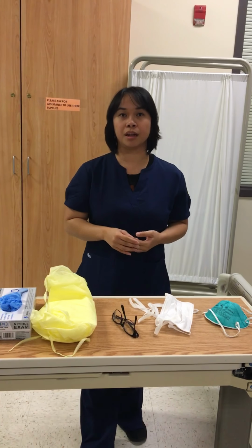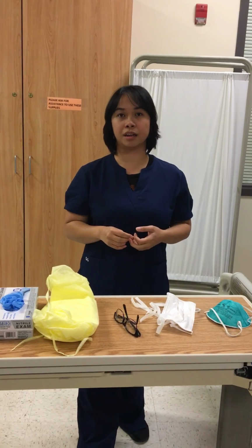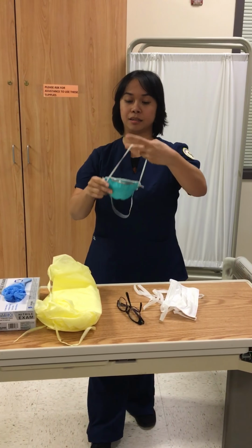So that means they are in a negative pressure room where there's an ante-room, like a room before the room, where you can put on your PPEs. So after I wash my hands for at least 15 seconds, I put on the shoe cover first, and then after that is the hair cap, and then after that is the mask.